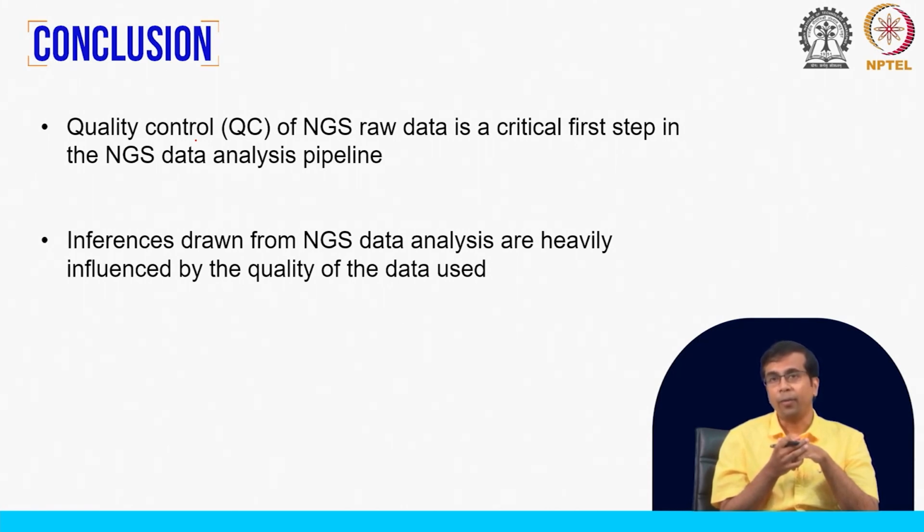Now, if you are dealing with low quality data, by mistake you might end up detecting certain mutations there, because the quality score is low, which means the signal to noise ratio is low. So, this will actually impact patients' lives. We are making decisions on therapy, and if we are making wrong decisions, that will impact patients' lives. So, this is something that is very important.